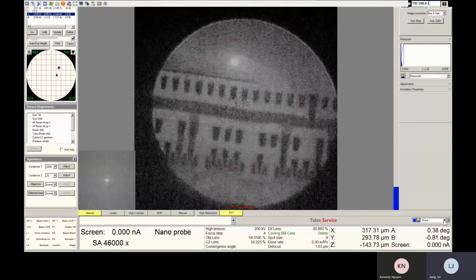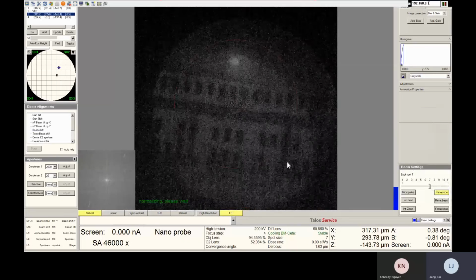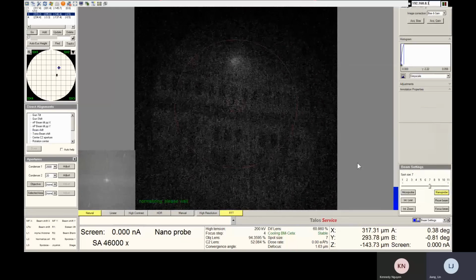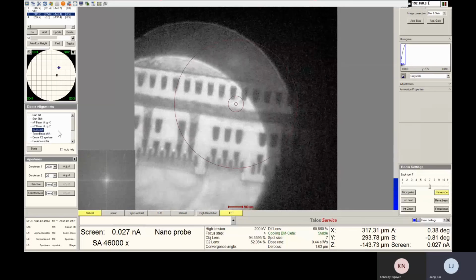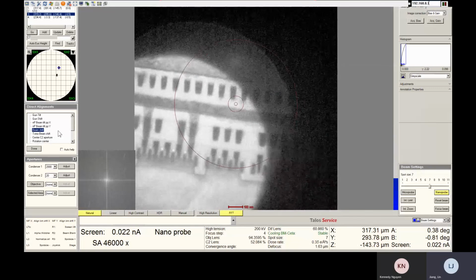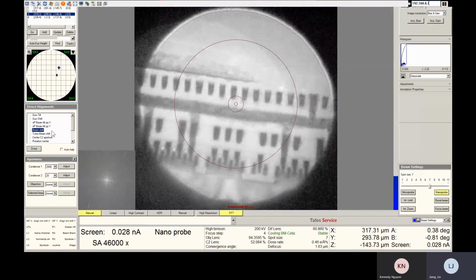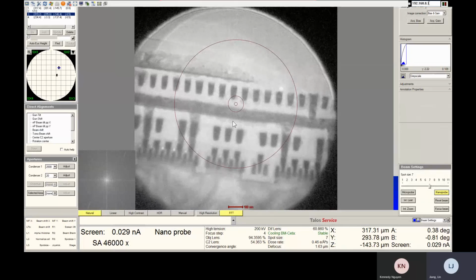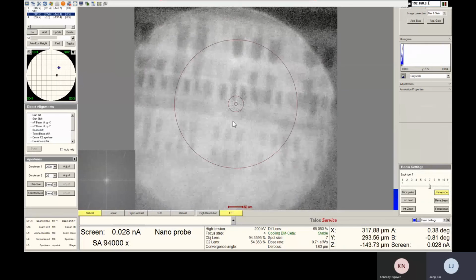Okay, let's go. Then we can go find the region hinges.